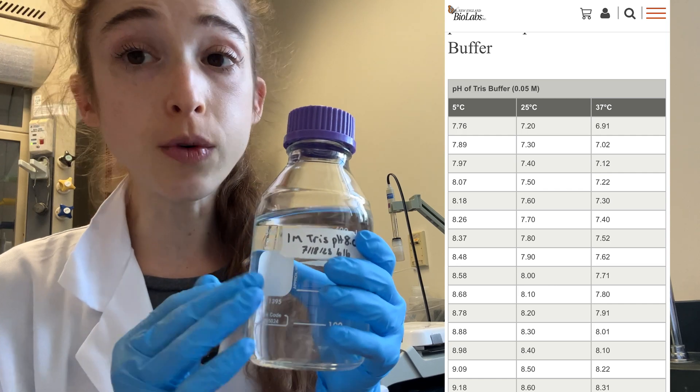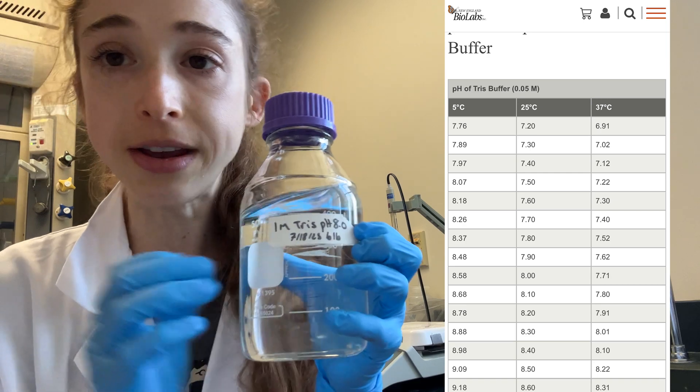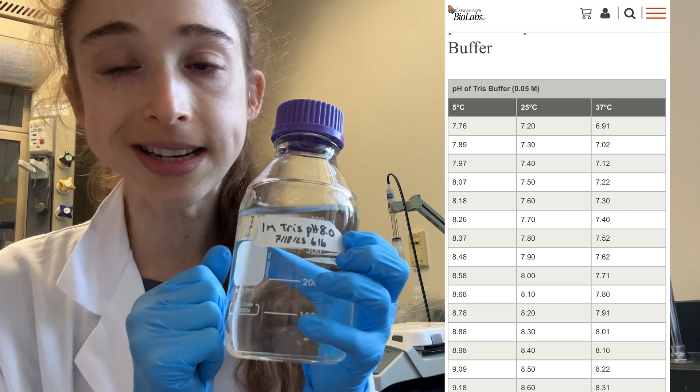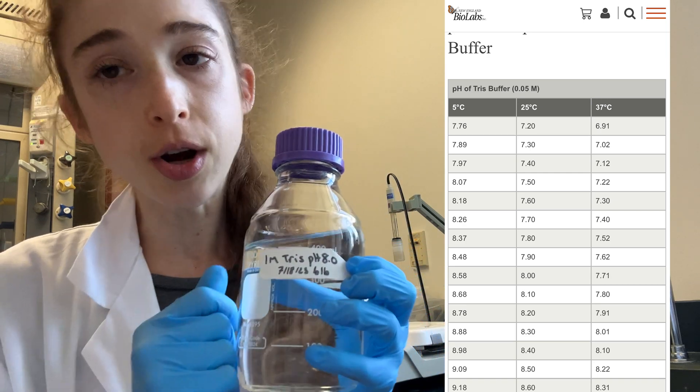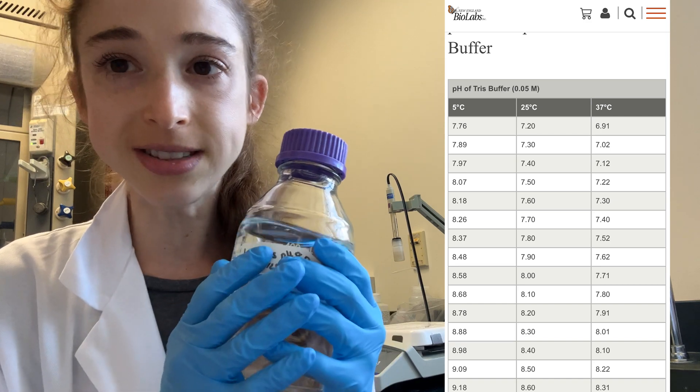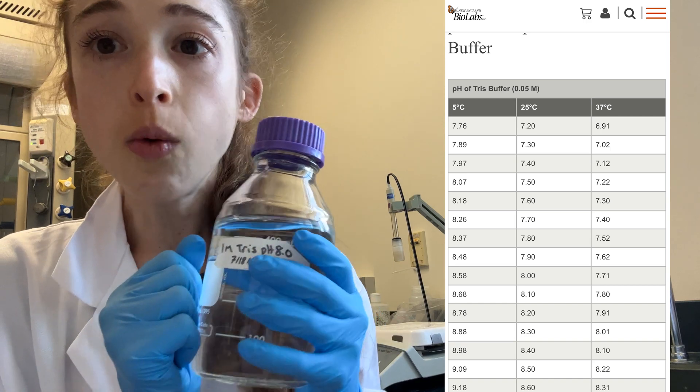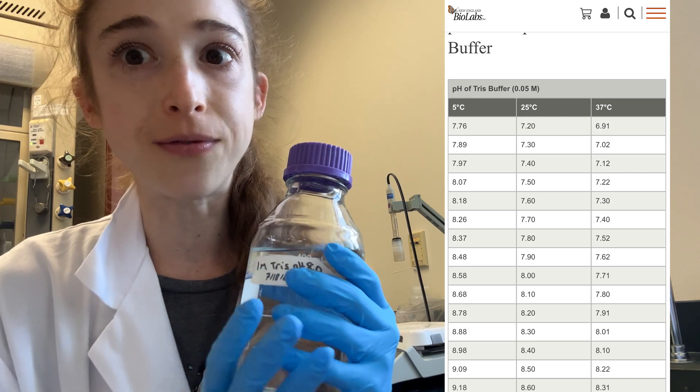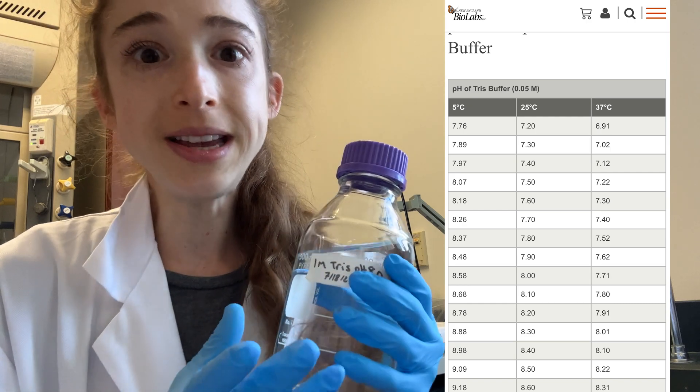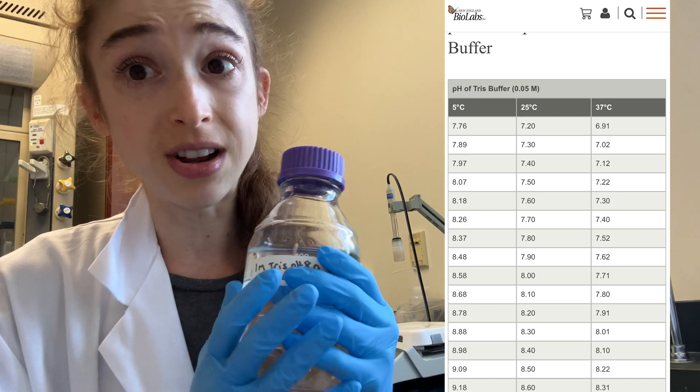This means that if you were to prepare your buffer to be a nice 8.0 at your room temperature, 25 degrees Celsius, and then you go and you use it when you're purifying a protein at 4 degrees Celsius because your protein likes the cold, well now your buffer is actually going to be at like 8.58, which means that there's going to be a lot fewer protons around.